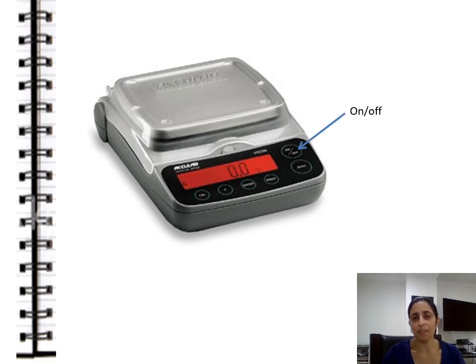Each of the balances has an on-off button. If it's turned off, you just press it and you wait for the display to reach 0. If it doesn't reach 0, you press the 0 or the tare button. On a lot of our balances, those are actually 2 separate buttons. 0 means that if there's nothing on the scale, we want to set a baseline, and we want that baseline to be 0. So when there's nothing placed on top of the platform for the balance, you press this 0 button.